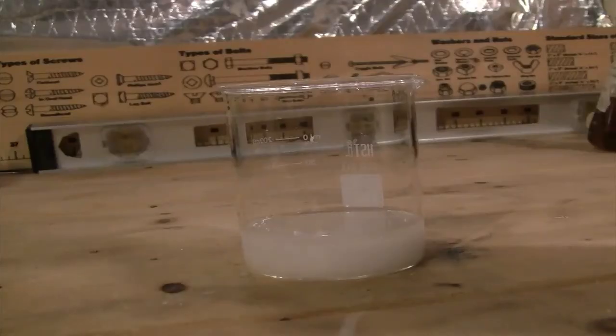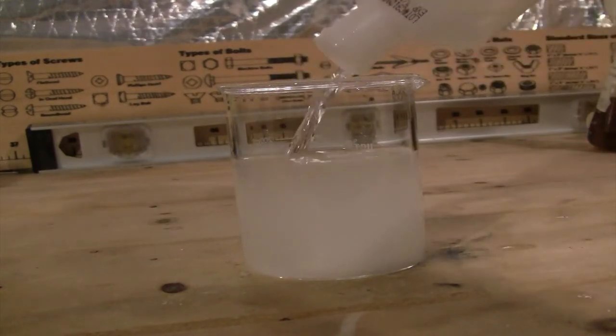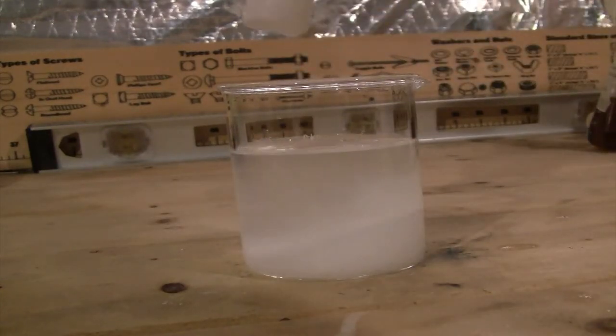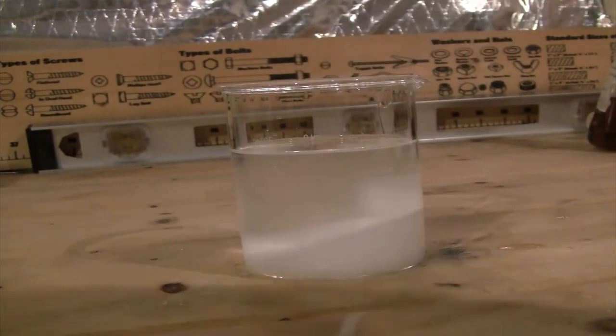The procedure for this method of purification is simple. To a beaker, I added table salt to around the 75ml mark. Then to the beaker, I added the alcohol, which in this case was 50% isopropanol.